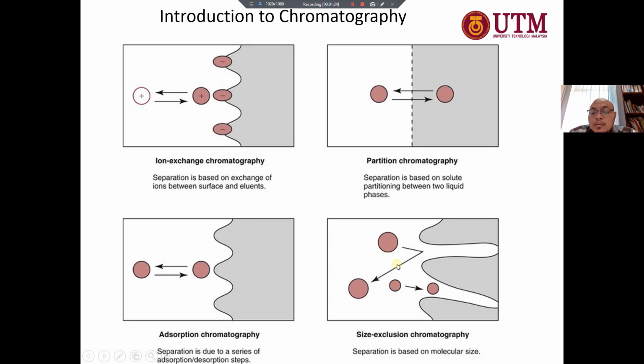If you ask me which one is better, it depends on the application. It's not necessarily that one is better than the others. For example, ion exchange is only for ionic compounds, but it's not useful for the analysis of non-ionic compounds.